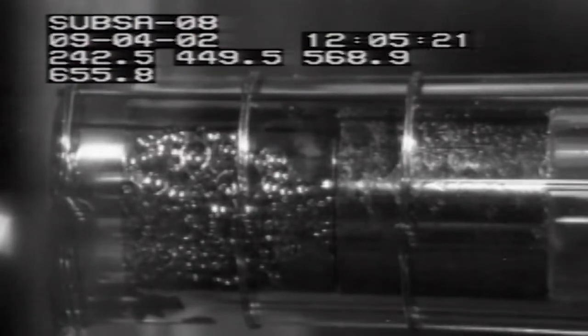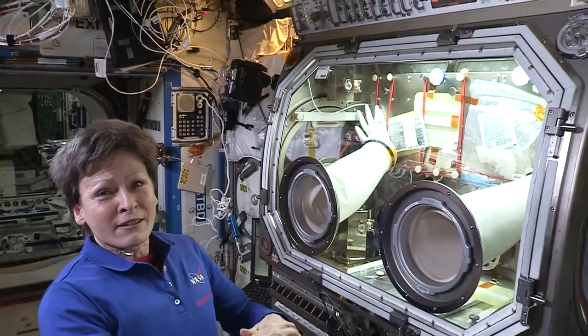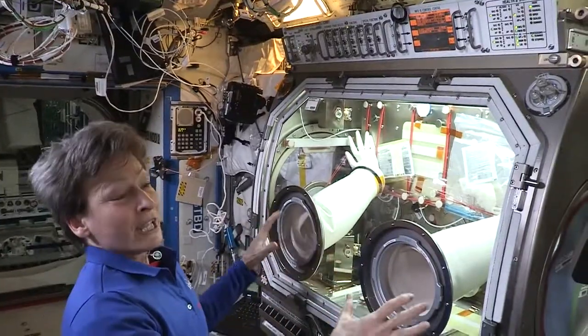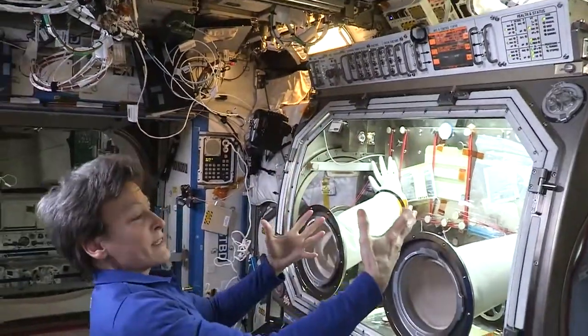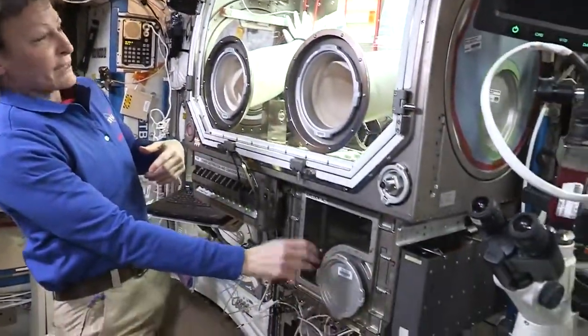So this environment was to protect us from what was happening inside the experiment. Now I'm growing cells and they have to be grown in a sterile environment, so now I'm protecting the cells from me by having them inside this environment. It's very flexible and we can change out all the experiments by opening up this big door on the front. Once we've got the experiment set up inside, you can access from the sides, or we have this little airlock down here that you could access from as well.